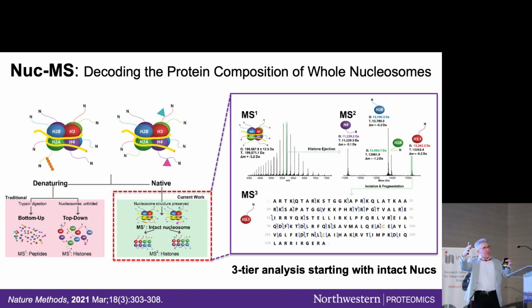You can eject out subunits and then sequence the proteoforms that are your subunits. That's the takeaway that I'd like you to pull away. And so let's just do this a couple times with different nucleosomes.